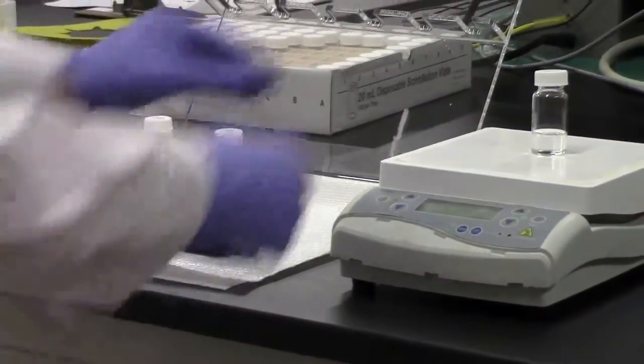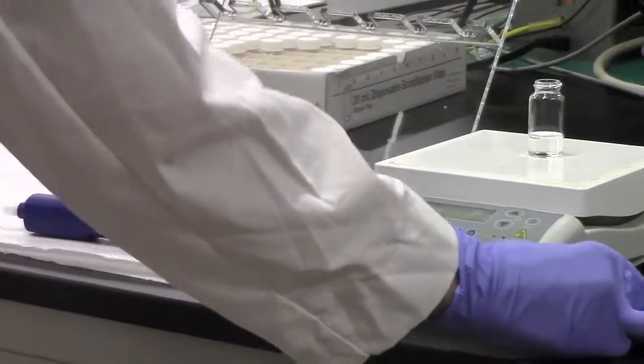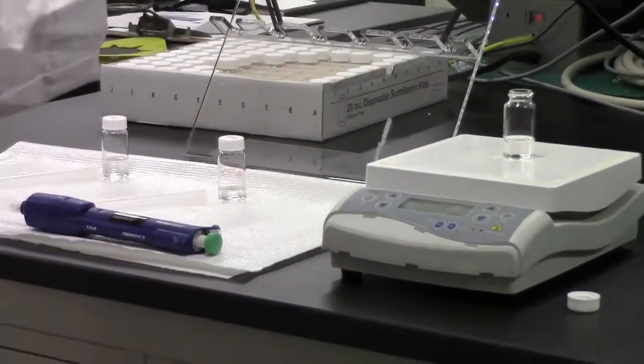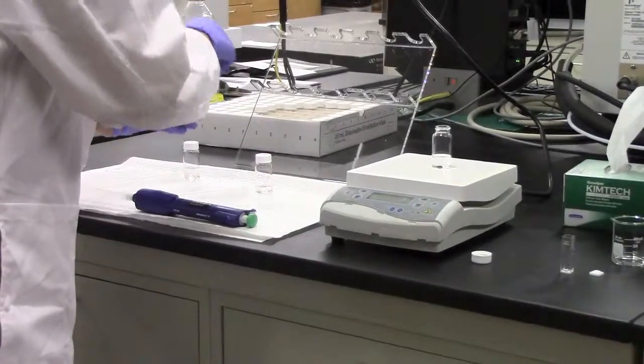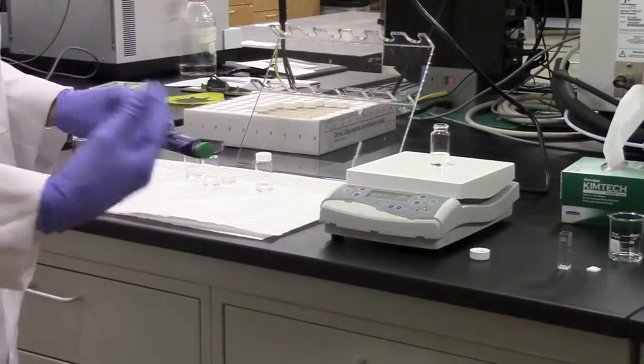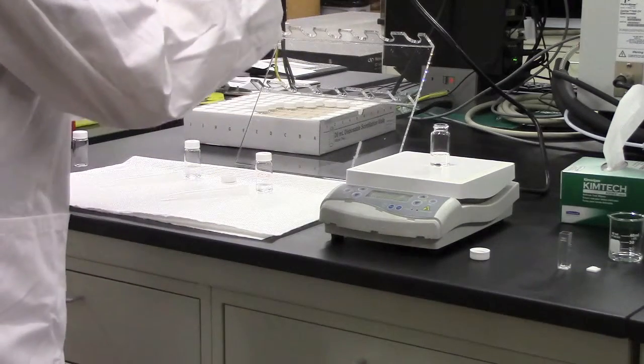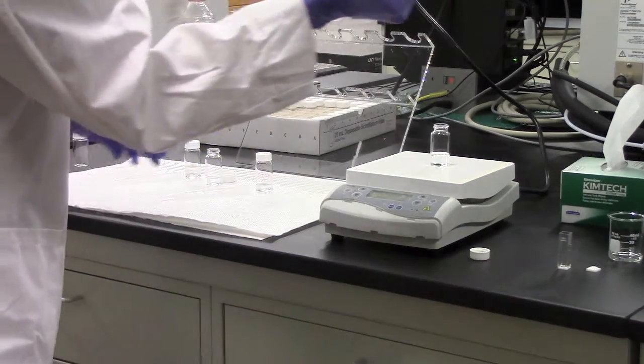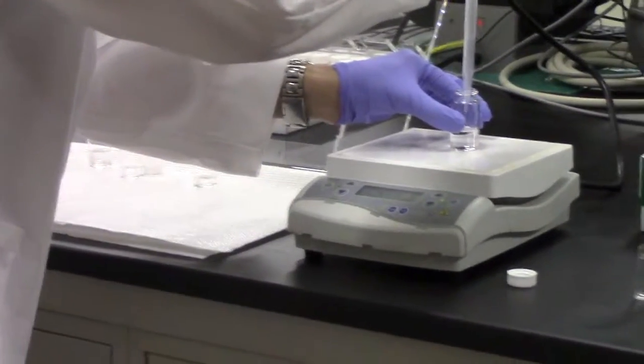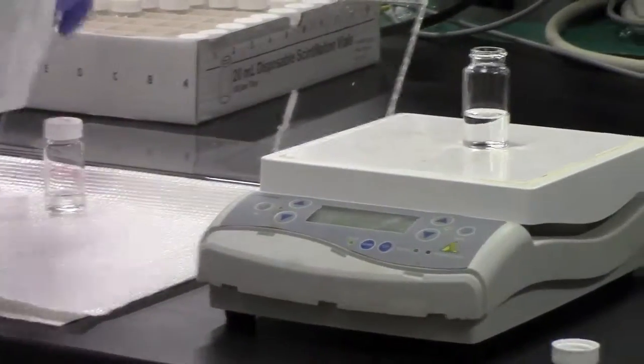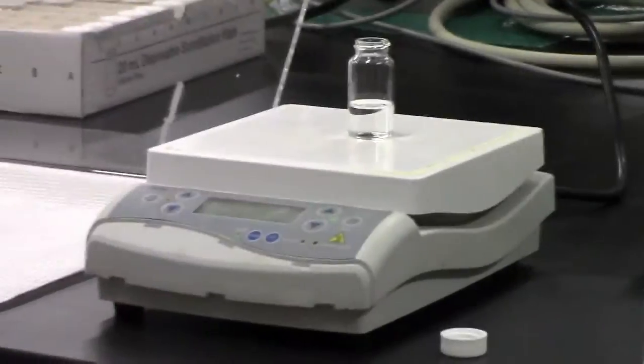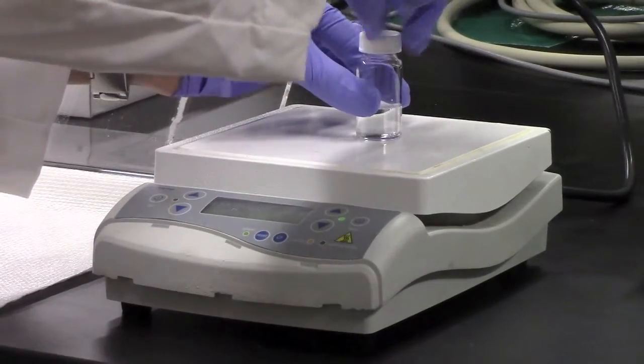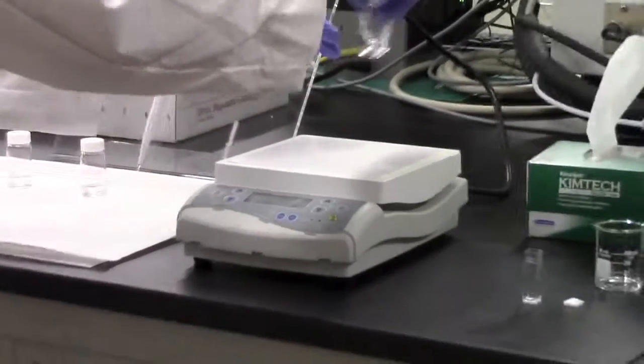Once the ethanol and zinc acetate solutions are warmed up sufficiently, you'll want to add in 1.8 milliliters of the tetramethyl ammonium hydroxide solution, which will then initiate the actual reaction. Take a micro-pipetter and a tip that's specific to it and add it in.